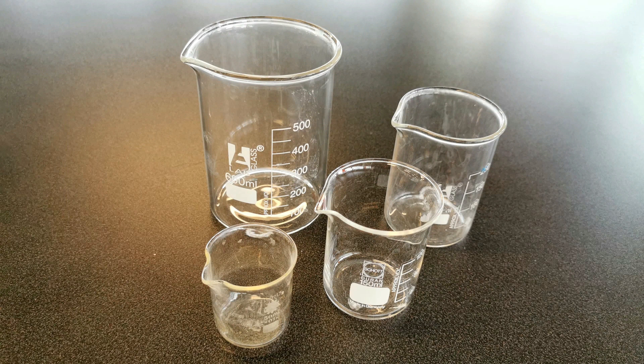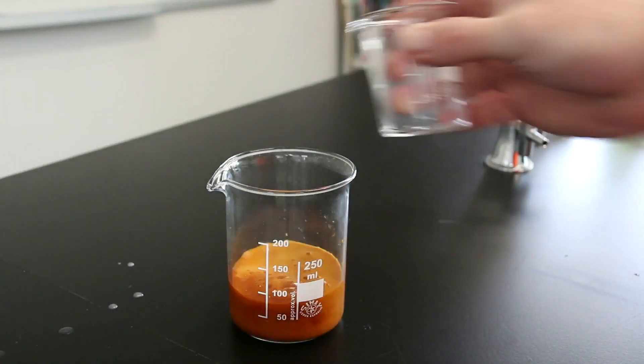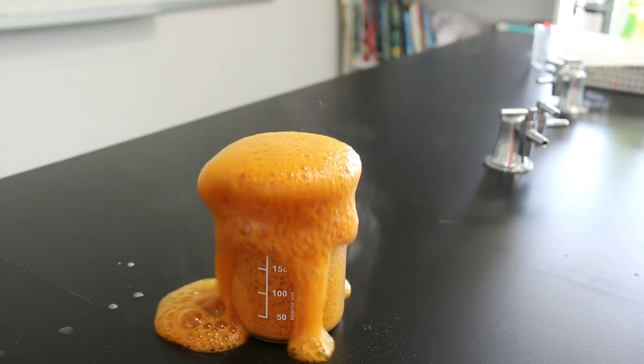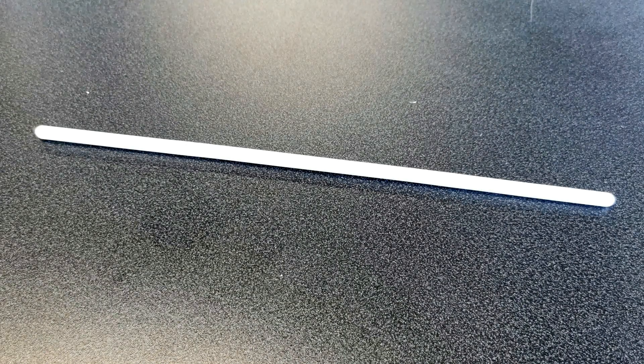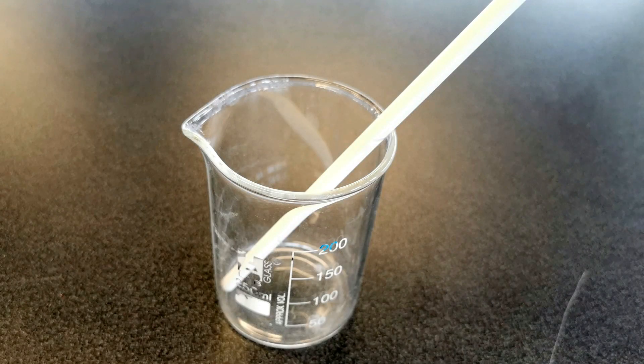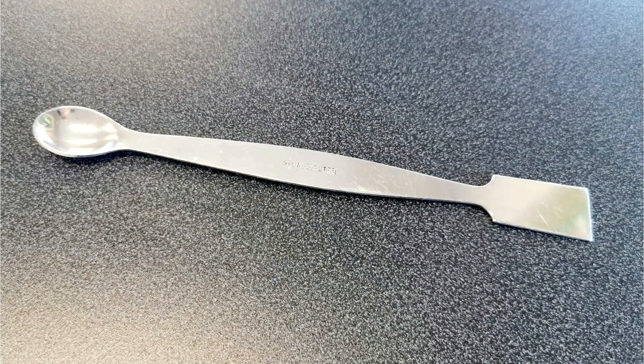More for just doing reactions in, like the catalyzed decomposition of hydrogen peroxide. This is a stirring rod — a plastic stirring rod — and its job, funnily enough, is for stirring in your beaker. You can get plastic or glass stirring rods. They're not just for stirring; in this photo a student is decanting a solution from a beaker.